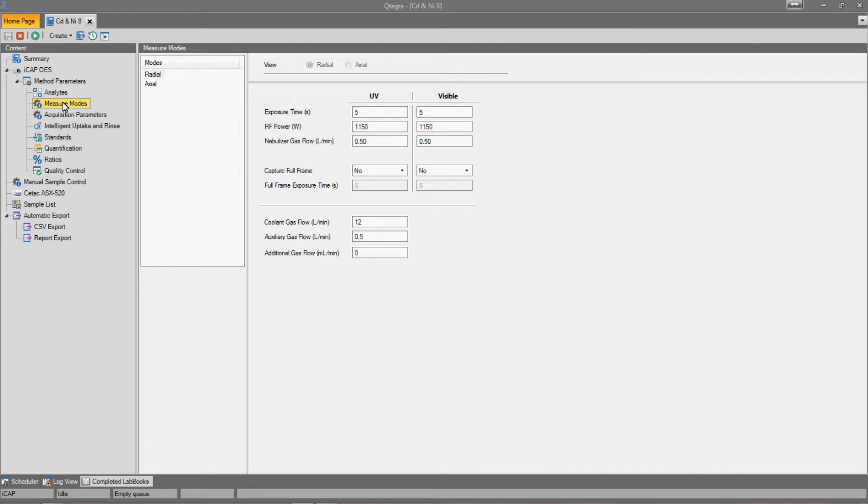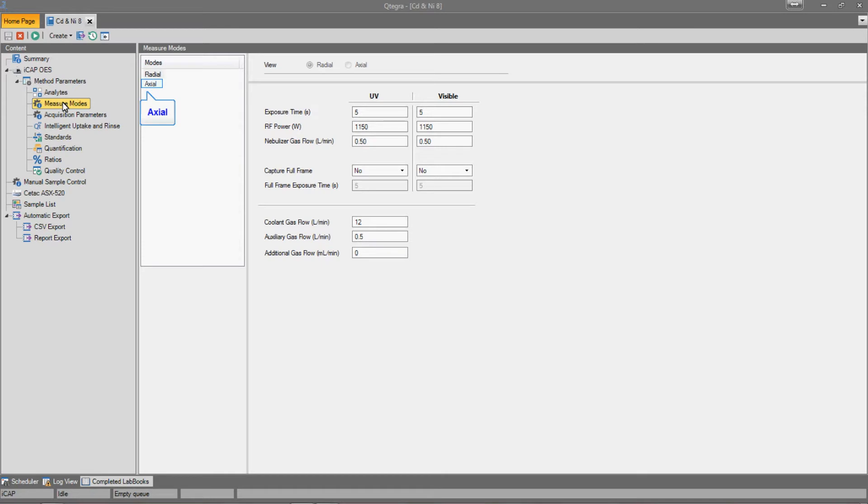Here, the full-frame parameters can be set for all four viewing modes: UV and visible, axial and radial. In this labbook, I will only set up the full-frame images to be taken for the axial UV and visible views. As a default, the option to capture full-frame images is set to No.